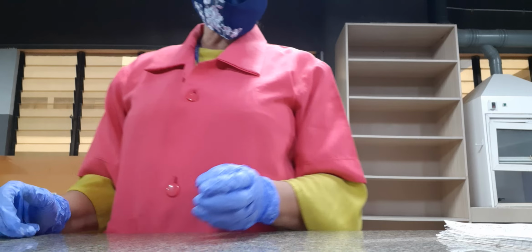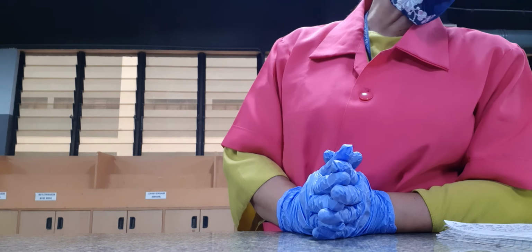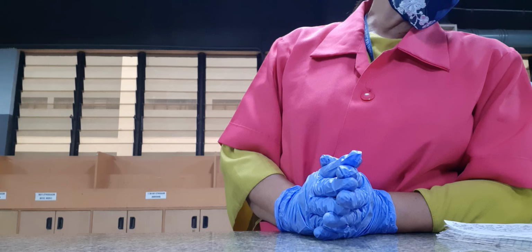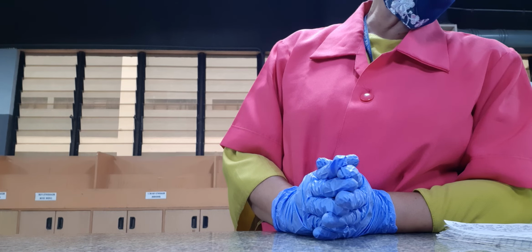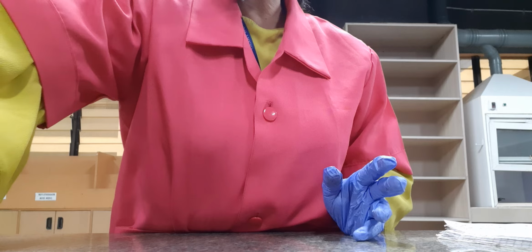So next, while waiting for our test tubes to undergo warm heating, we will proceed with our third test, oxidation test using potassium dichromate and dilute sulfuric acid.